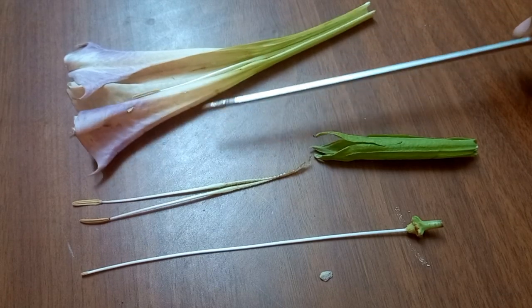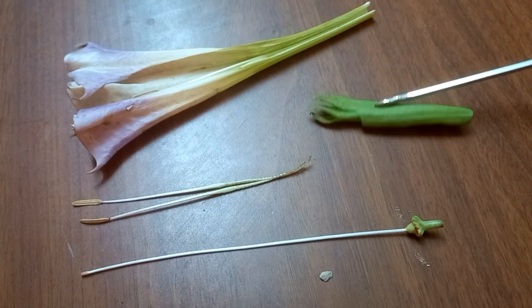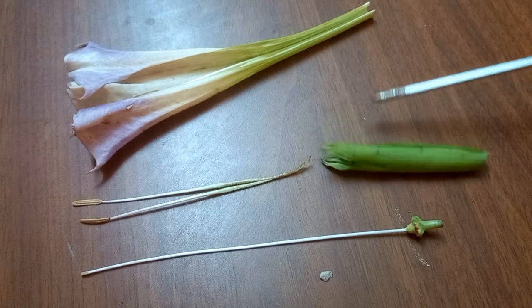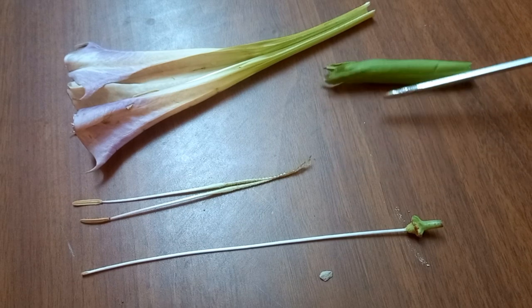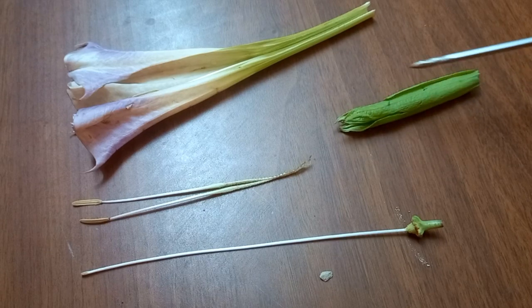Now I have dissected the dhatura flower, and you can see that the first part of the flower is the sepals, and there are 5 sepals in dhatura, present at the base. Usually sepals are present at the base of the flower and are green in color, and here all the 5 sepals are fused with one another.